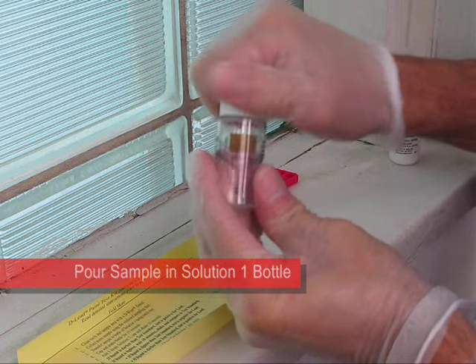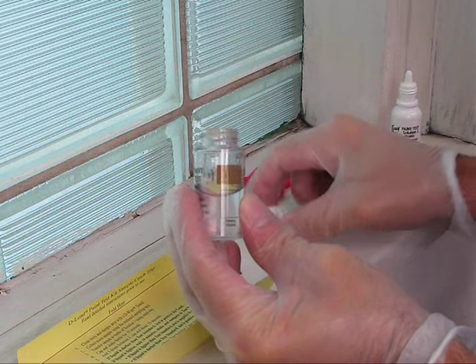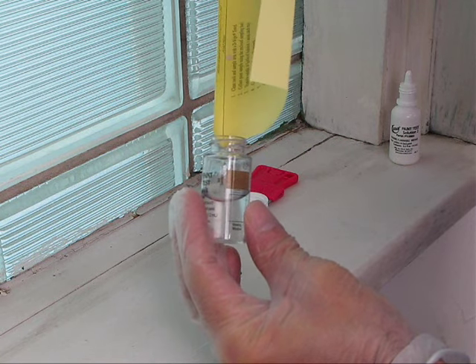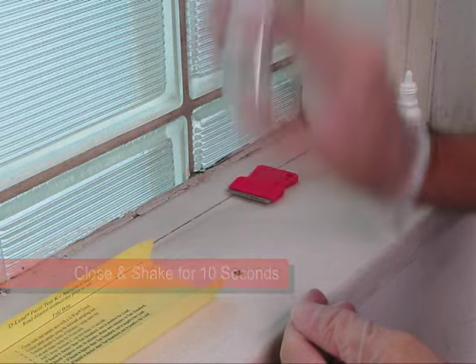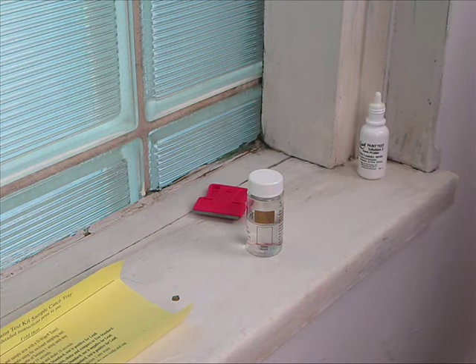Pour the entire paint sample into a fresh bottle of Solution 1. Make sure all of the sample is transferred to the Solution 1 bottle, even if the sample has broken into multiple pieces. Cap and shake for 10 seconds. Set the bottle aside for at least 2 minutes to allow Solution 1 to penetrate the paint sample.